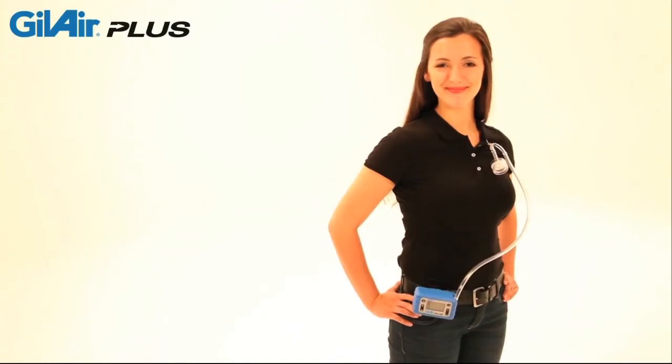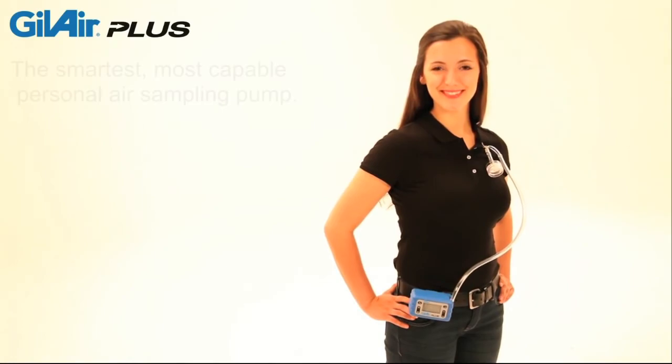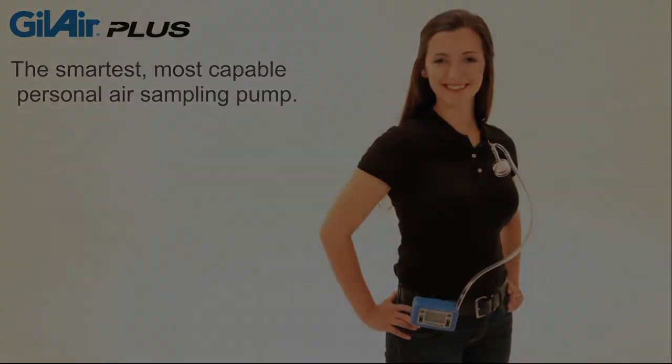Backed by the Gillian name and an unparalleled warranty, GillAir Plus is the smartest, most capable personal air sampling pump.